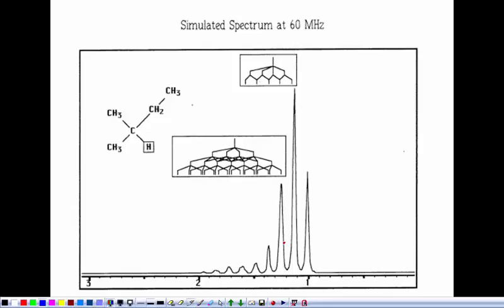And that's, while it's not something that you necessarily have to worry about, it is something that other people have to worry about when they have lots of hydrogens that don't vary much in chemical shift. And that's why you see some of these 900 megahertz magnets, or if somebody has over one whatever it would be magnet, then that's why they're doing it.